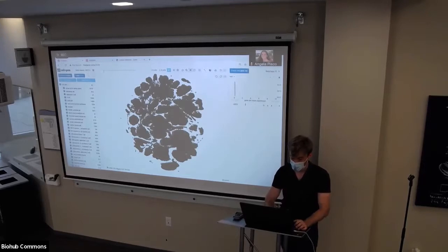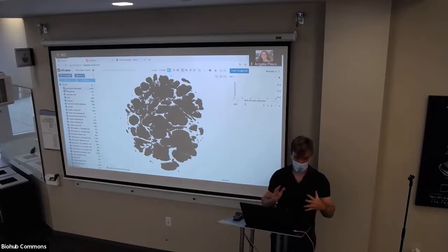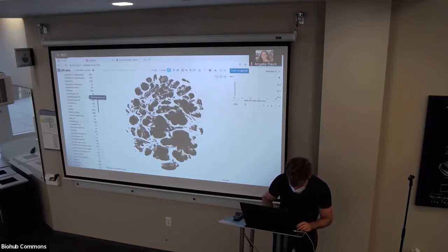I've already done some re-embeddings because it's going to take forever with this data set, but I'm going to show you exactly what steps I did. This is for all zebrafish cell atlas people that want to go through their data with great degrees of granularity. So let's say I want to know how many cell types or subtypes, or are there any, within kidney epithelial cells.